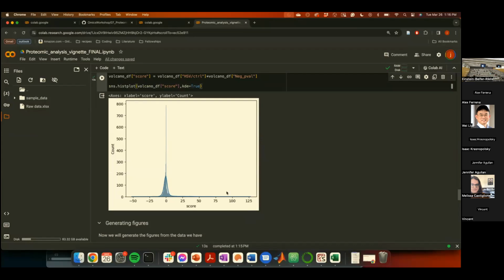So the question is, how are we assuming that the data are normally distributed? We assume the imputed values come from a uniform distribution, but the entirety of the rest of the data follows a normal distribution, so why the disparity?